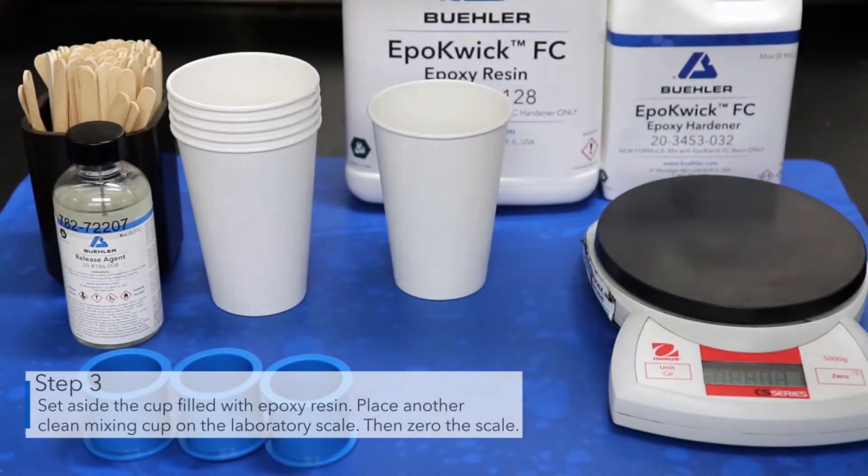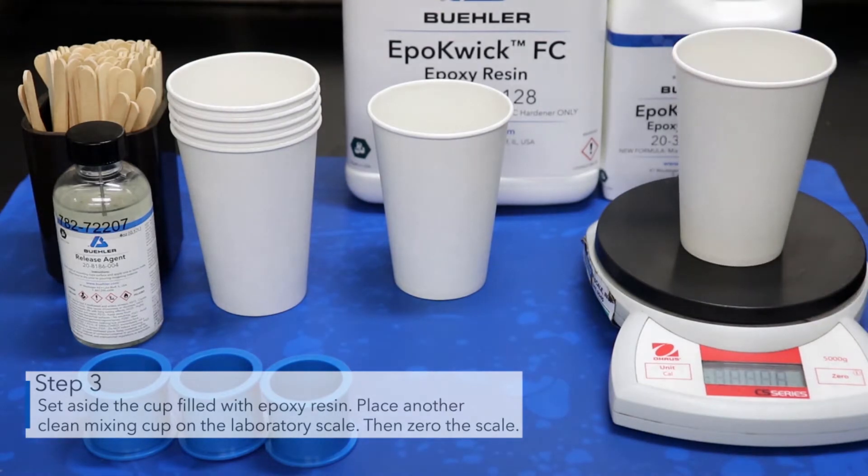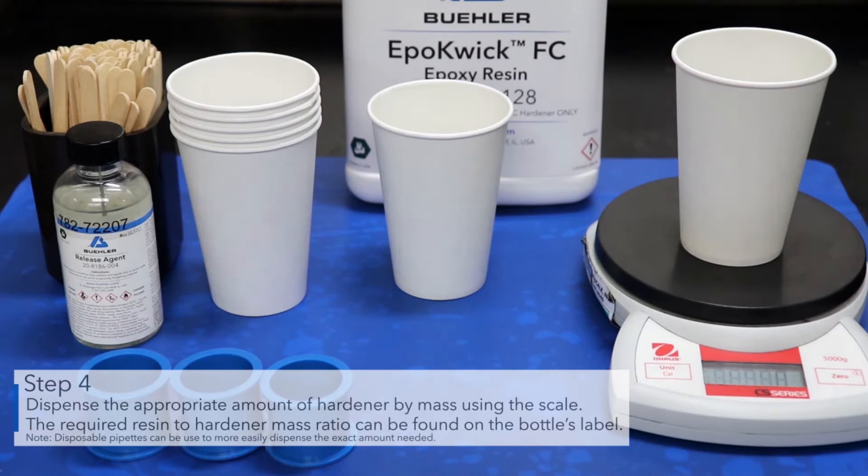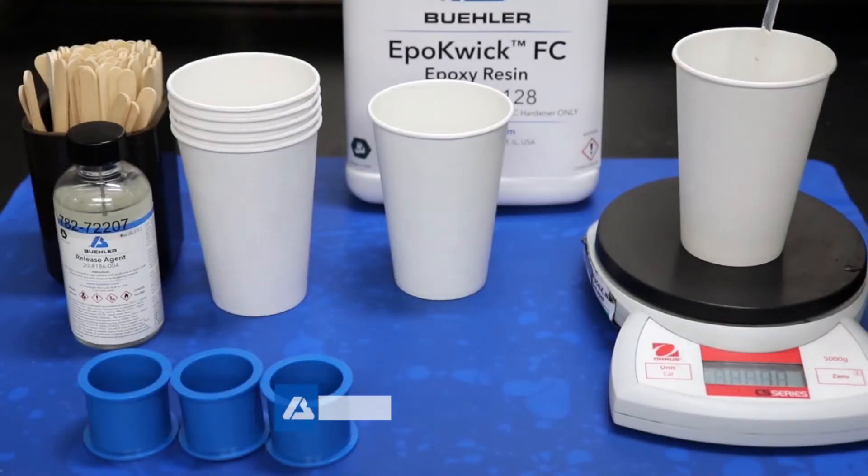Place another clean mixing cup on the laboratory scale, then zero the scale. Dispense the appropriate amount of hardener by mass using the scale. The required resin to hardener mass ratio can be found on the bottle's label. Disposable pipettes can be used to more easily dispense the exact amount needed.